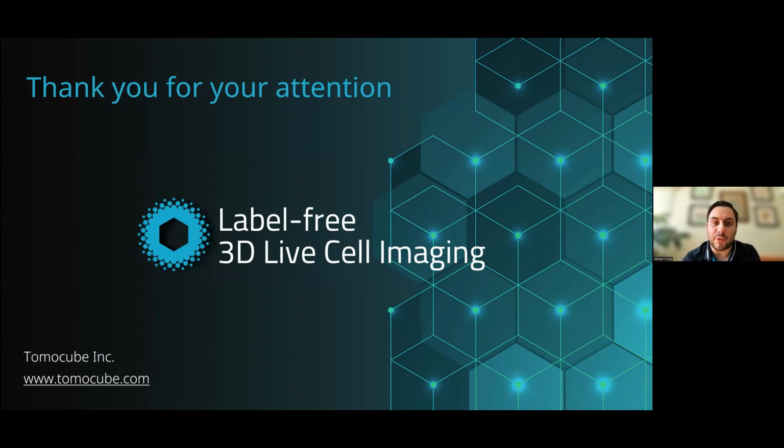So the first question was, when you image the same field over 42 days, does this mean the sample sits in the microscope for the whole time, or can we take it out and find the same area by some means? So how was the 42-day time lapse achieved?